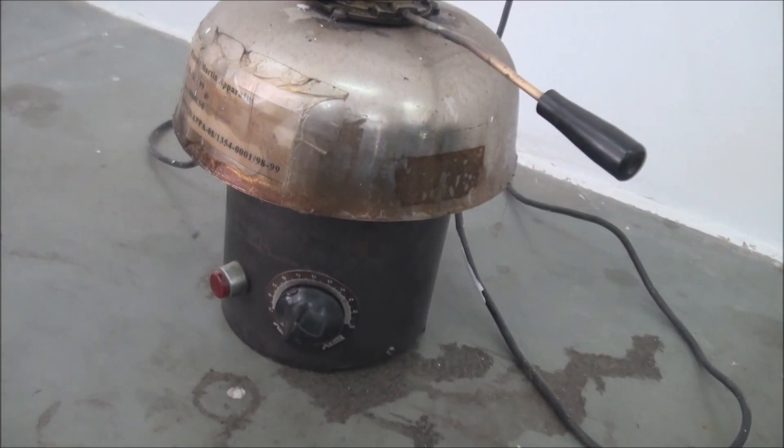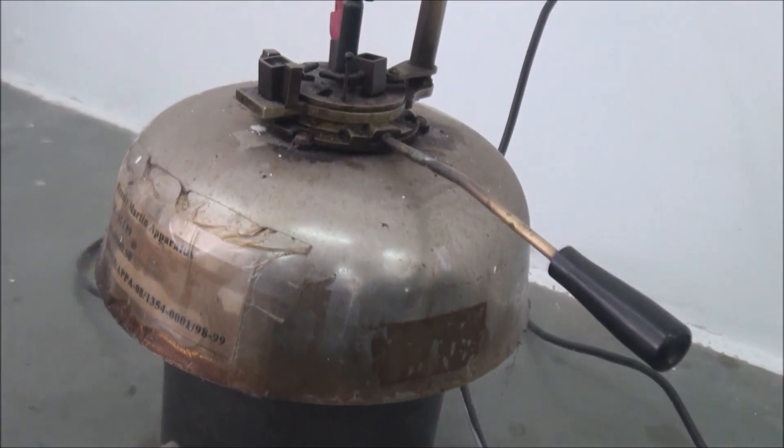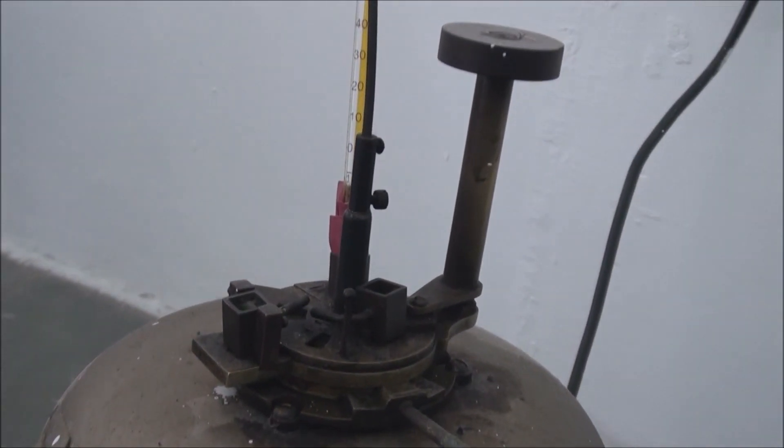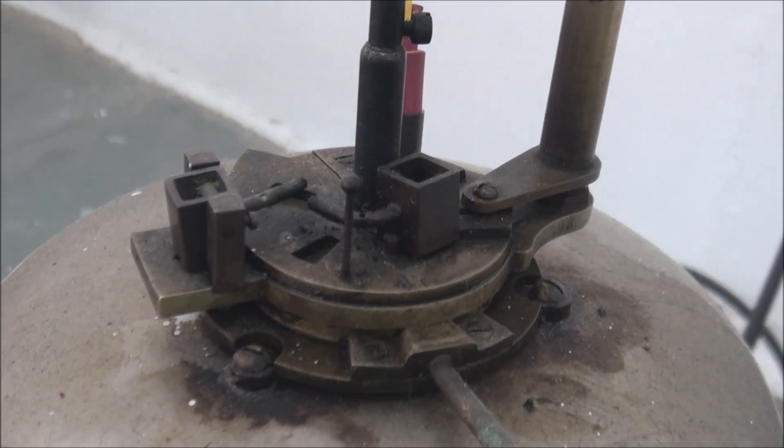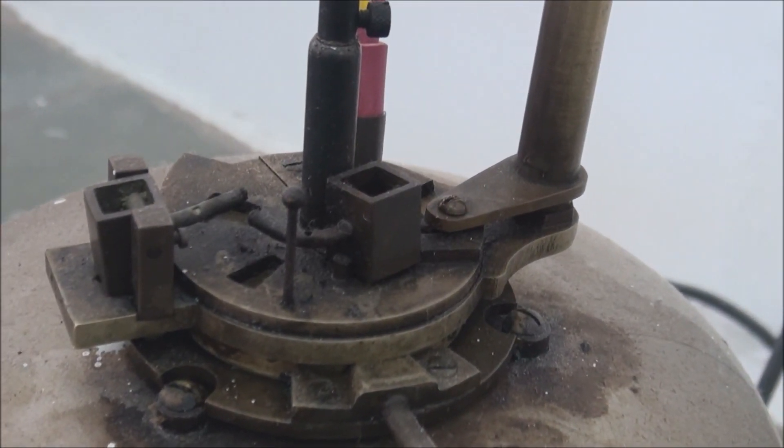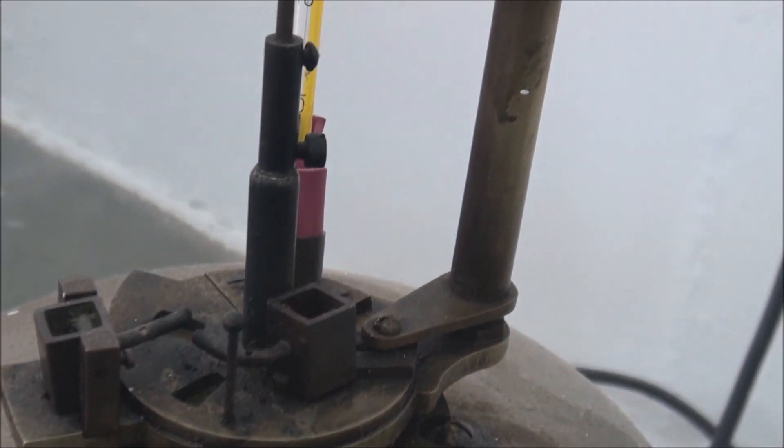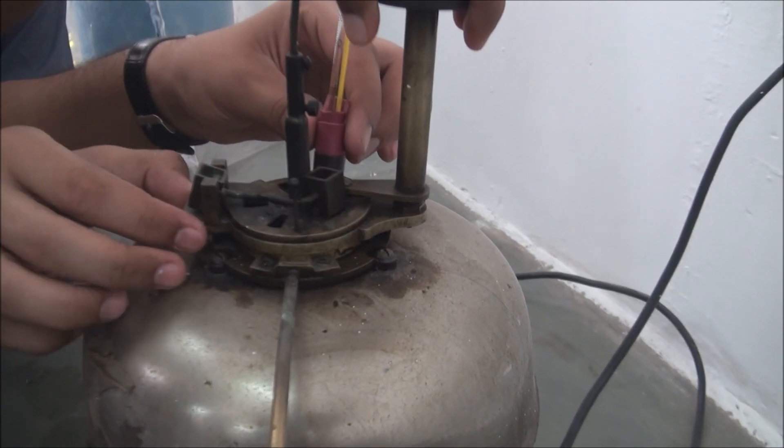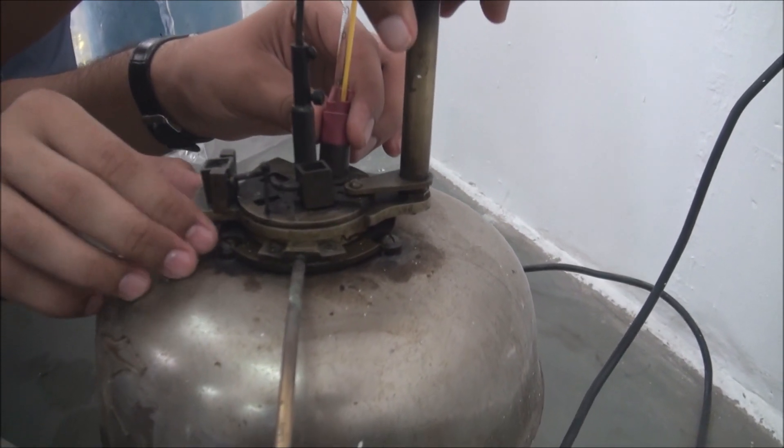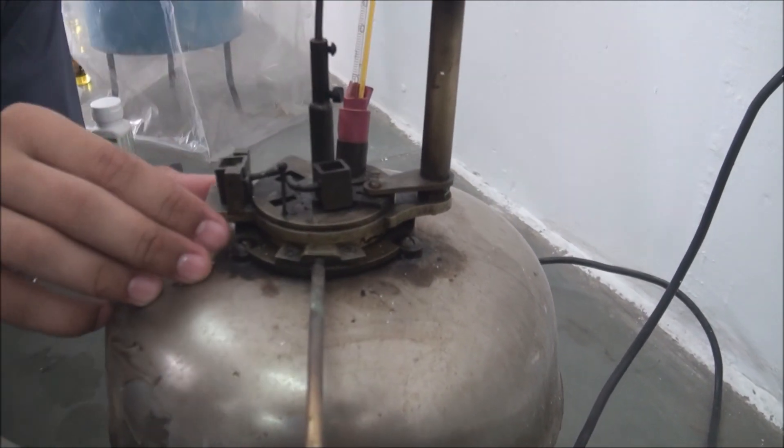The apparatus shown here is Penske-Martin closed cup apparatus. In the bottom, a dial is provided to control the temperature. On the top of the apparatus, the handle is used to remove the top cover for filling the lubricant. On the upper cover starting from left are the compartment to fill kerosene for the flame, stirrer in the center with thermometer, and a handle to open the lid to visualize the flash and fire point.